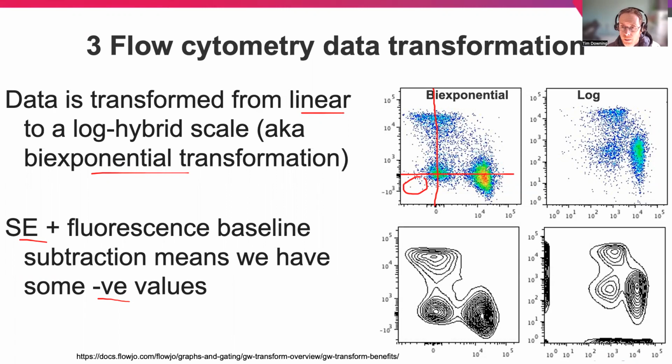That would mean if our key components of variation are, say, across this area, maybe up to this point, and the same on this range for the other axis, we don't necessarily want to focus in on this area. So we're effectively transforming the visualization of our data and focusing it in a different way. And the same way we have colors up here, we have a kind of contour map of the same thing down here. And the same applies on the right.